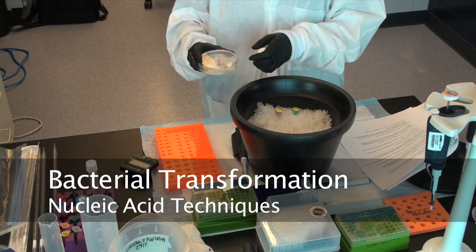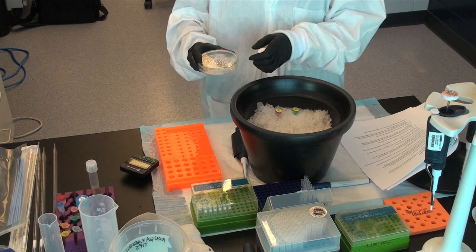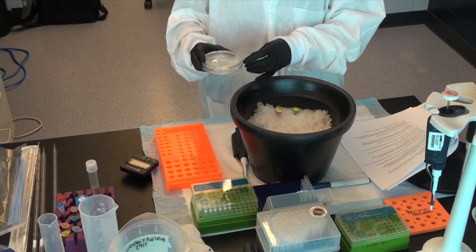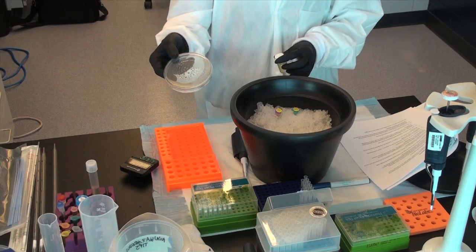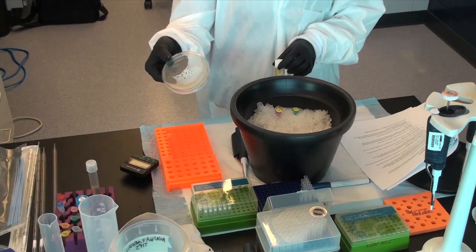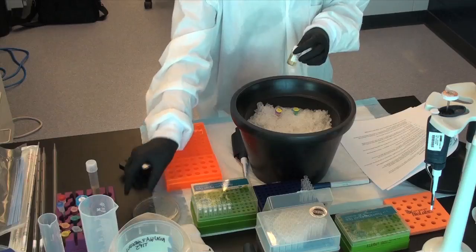Bacterial Transformation. Step 1: Pre-warm and dry two LB Luria-Bertani agar plus ampicillin selective media plates by placing them in the 37 degrees Celsius incubator, media side up, to remove excess moisture.